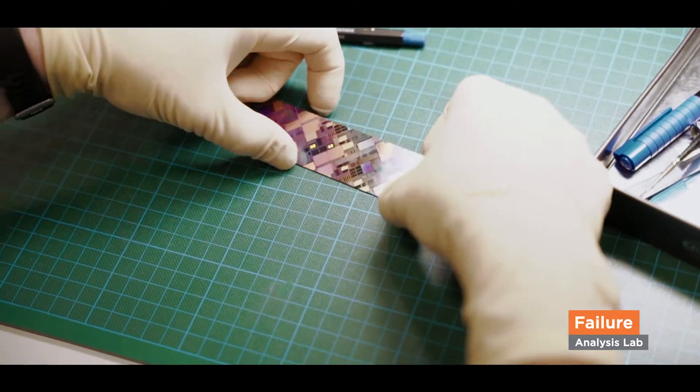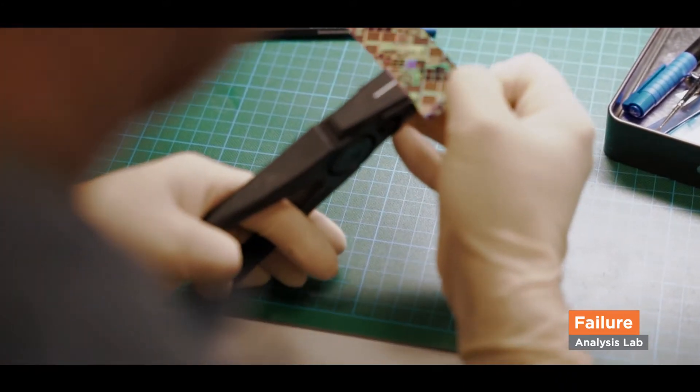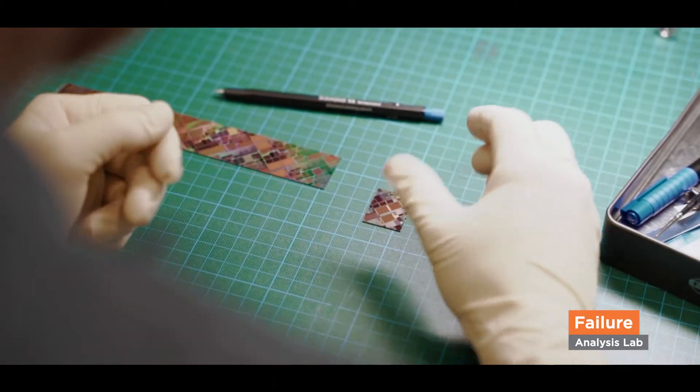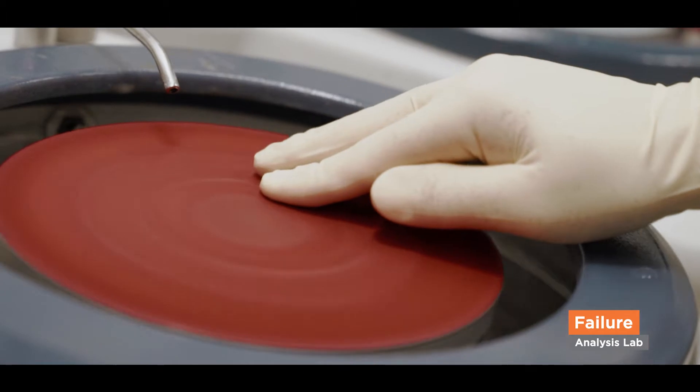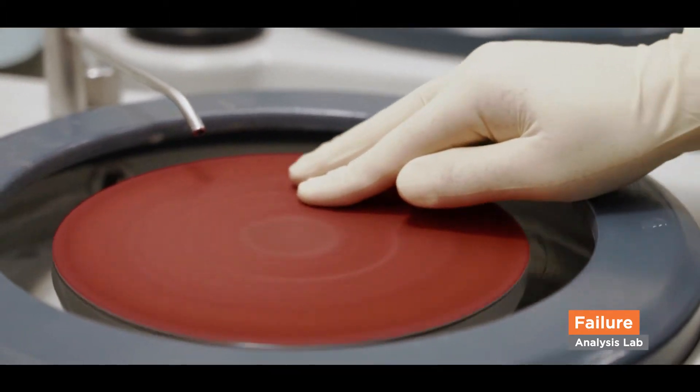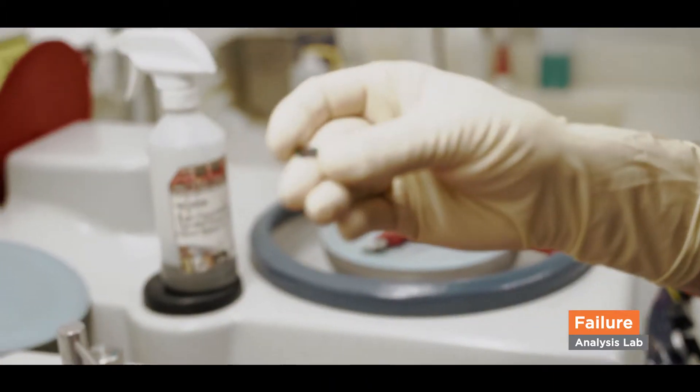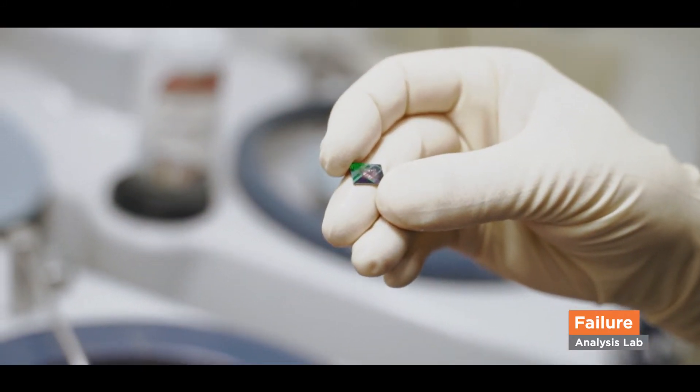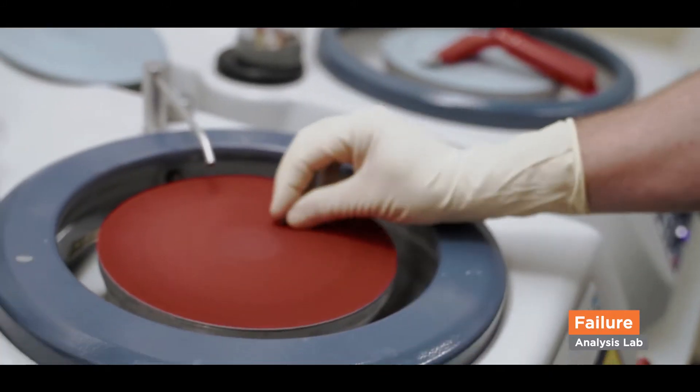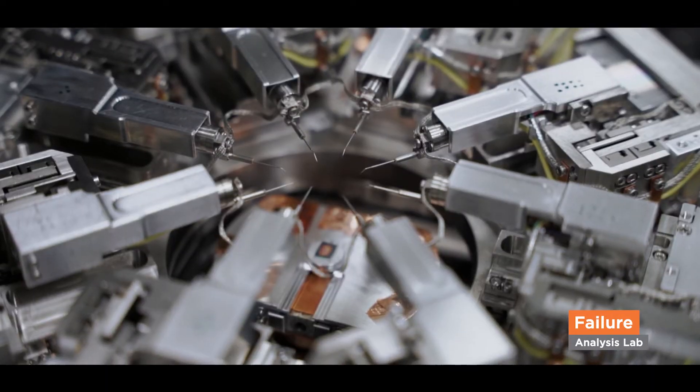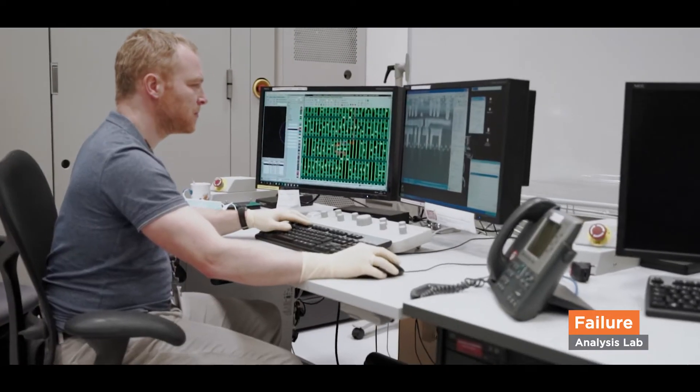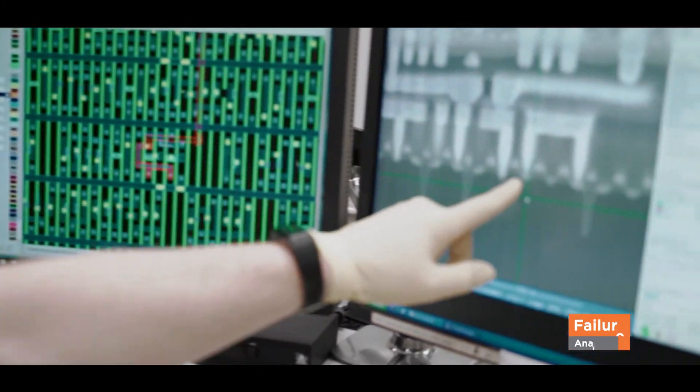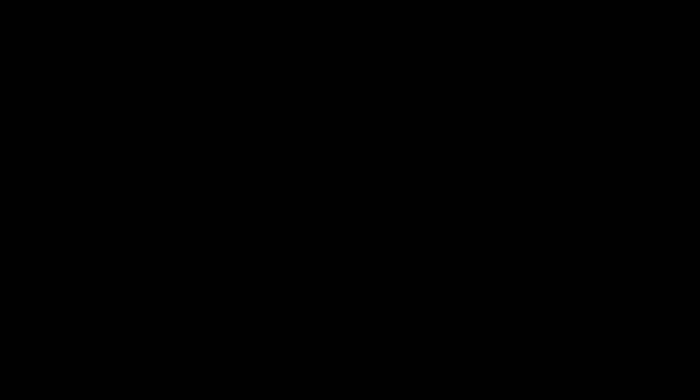For our nano probing, we need to break a small piece out of the wafer. To get to the layer of interest, the chips must be thinned or ground down. For this, we use a small polishing tool with polishing cloth and a diamond polish suspension. In the next step, we nano probe the devices. With the support of the layout, we can very precisely follow the preparation process and precisely document the failure and its location.